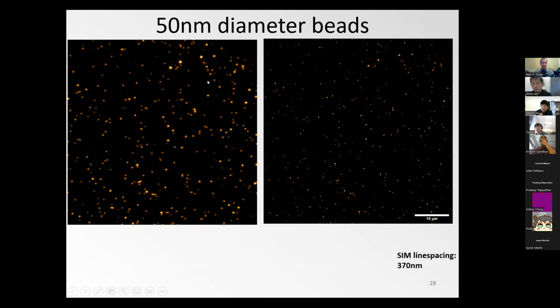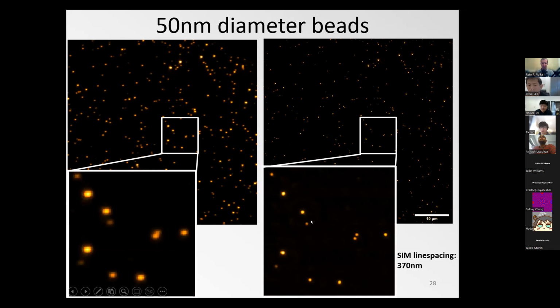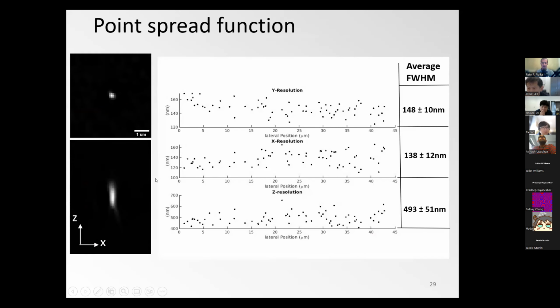And here, this is some imaging of 50 nanometer beads, here on the left with the OPM, and on the right with the OP-SIM, as we call it, so it's a structured light sheet. You can see numerically, if you put some values on that bead, it more or less doubled the resolving power. From about 300 nanometers, it went down to slightly below 150. Here we also did some statistics over 100 beads, so it's fairly consistent over its field of view. And the Z resolution is a bit poorer, only around 500 nanometers.